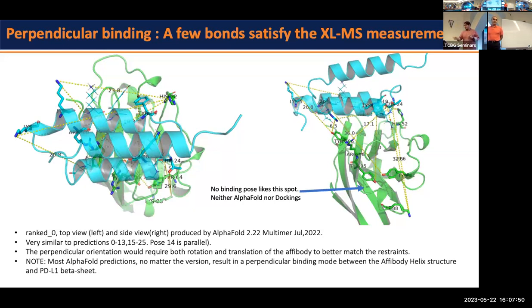I see. One thing that I didn't mention on ClusPro is that in order to bind to the binding site I wanted, I needed to add distance restraints. So I said, okay, keep these two proteins together in this site, because I knew from the PDB and about 60 structures that it was the most probable binding site. I didn't put many restraints, just three, and they were very flexible, so it wouldn't bind to the opposite side.